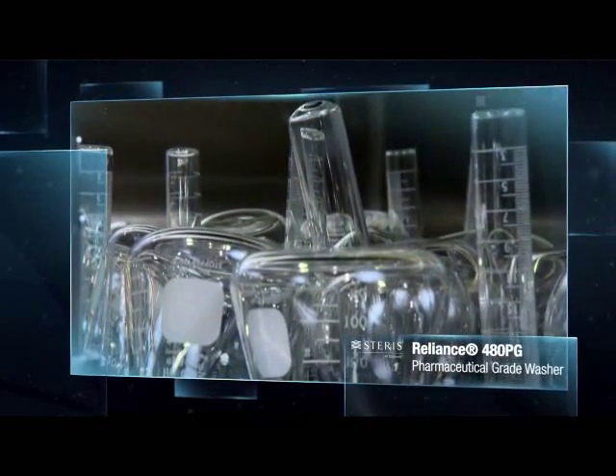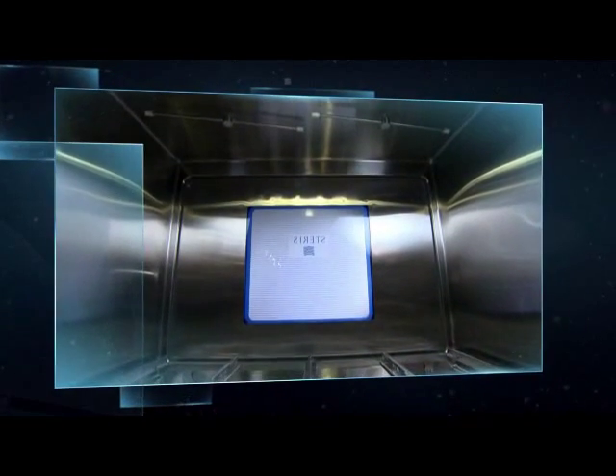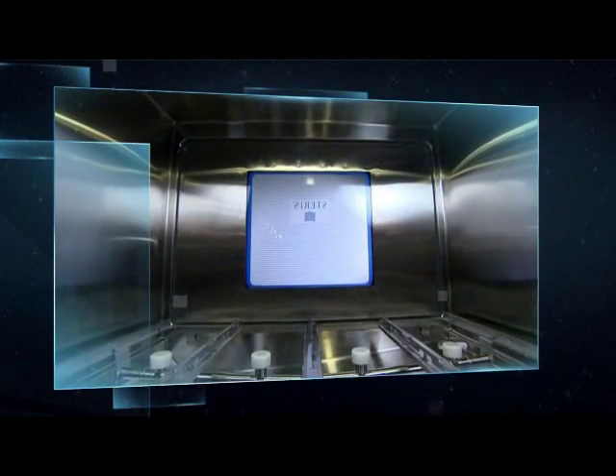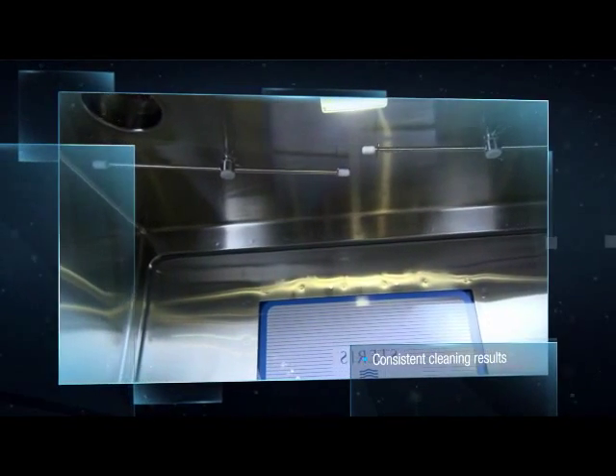Tanks, containers, glassware and more. This advanced washing system offers several innovative features that help deliver consistent cleaning results in applications where current good manufacturing practices apply.